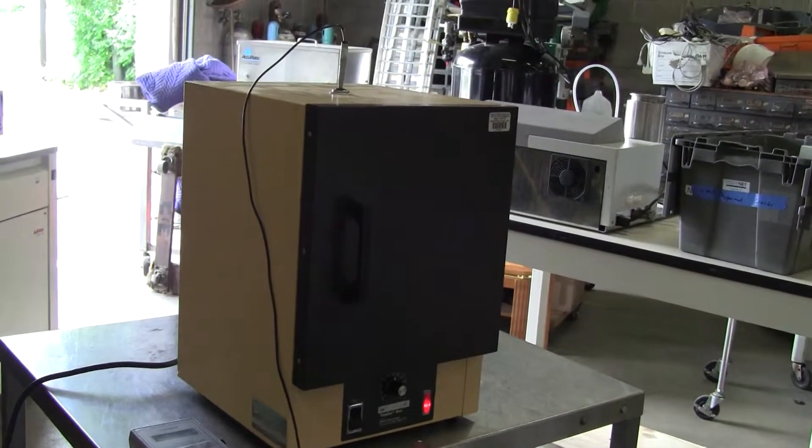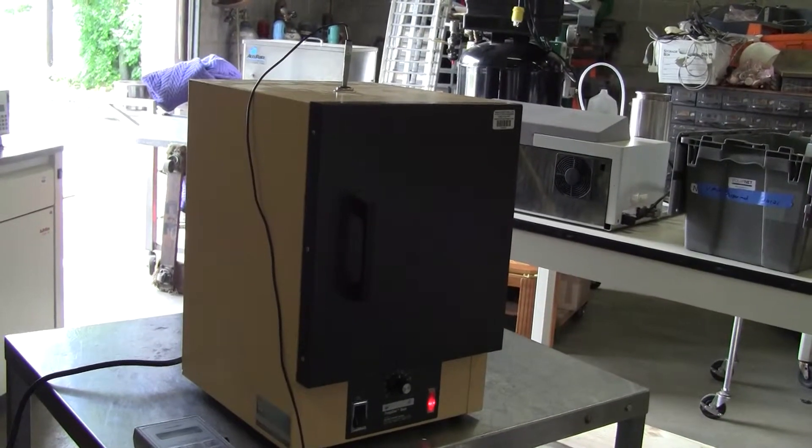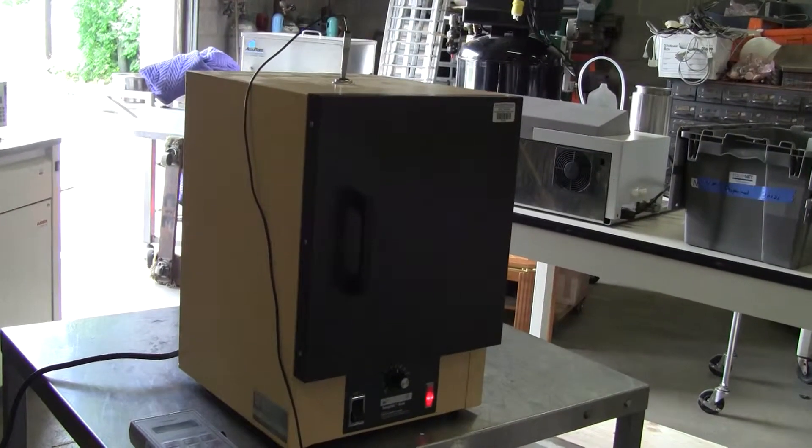Hi, this is Jim from HitekTrader. We're looking at a LabLine TempCon Oven. It's a Gravity Oven, model N8620-1.